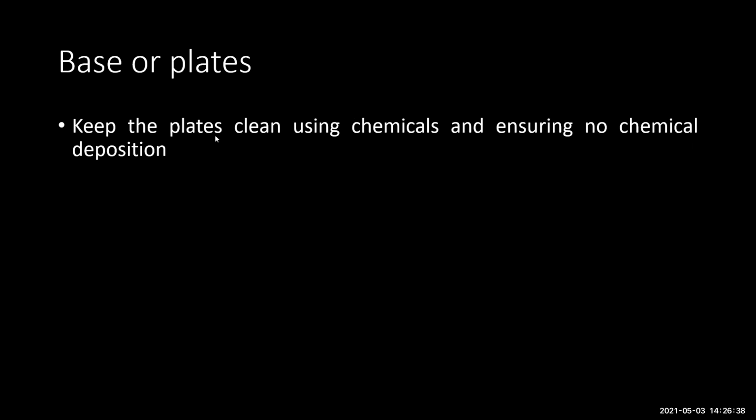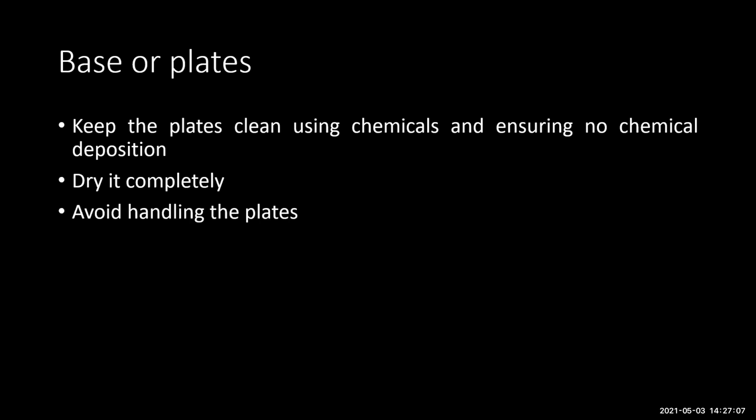So make sure the plates are cleaned using chemicals, and make sure these chemicals are not allowed to form any deposits. Once you have used the chemical to remove the stationary phase from the previous experiment, make sure that you also remove these chemicals. No deposits should be left behind after that. Dry it off completely.